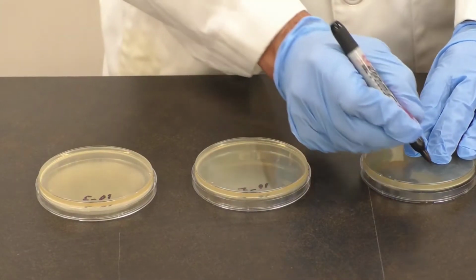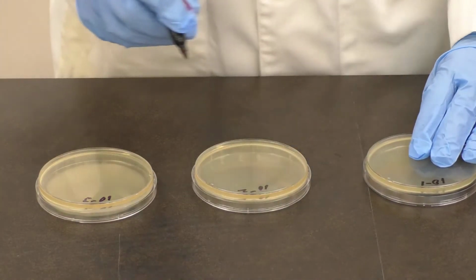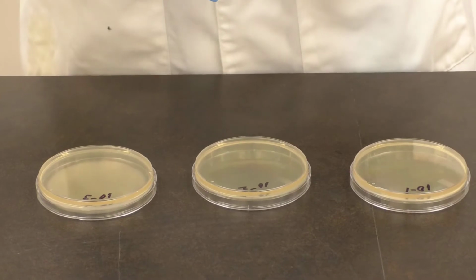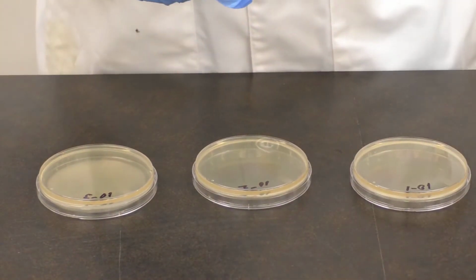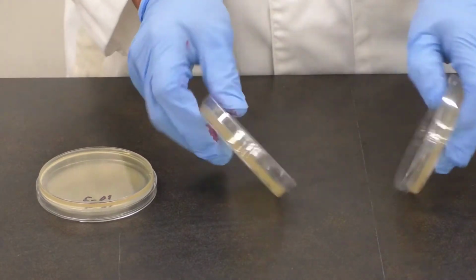by the spread plating method on these three agar plates. We're going to label these plates. So I'm labeling the three plates from the three dilutions. I'm going to spread plate 100 microliters from each dilution onto the plates.